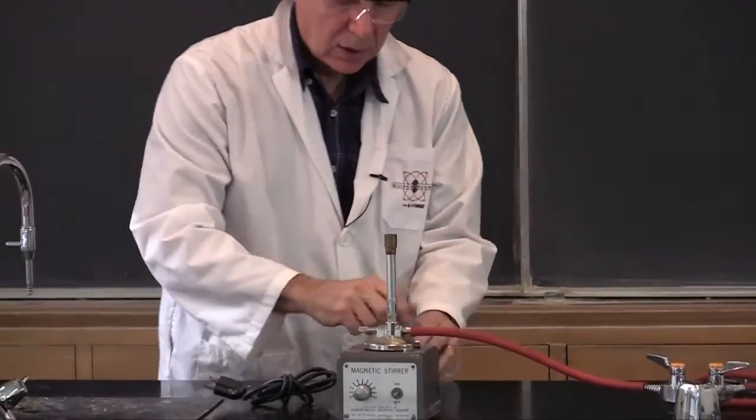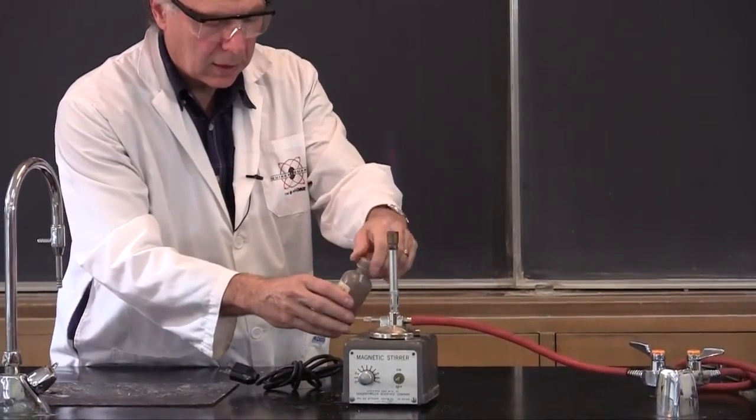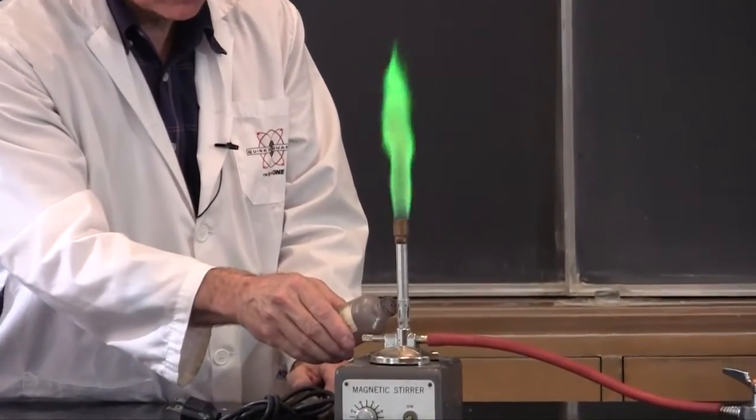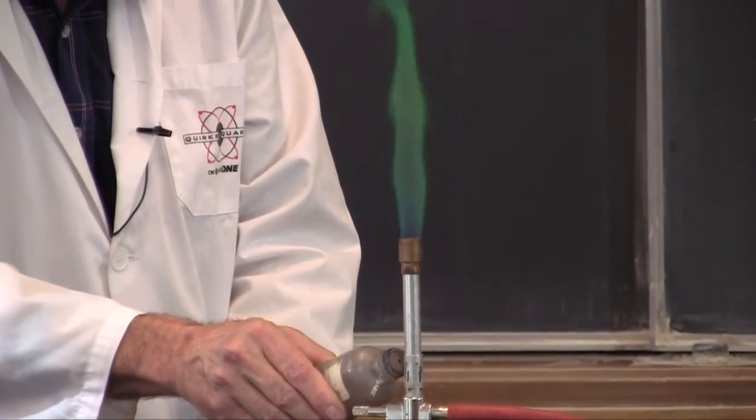All right, so shake it up a bit. You put it up close to the opening and just give it a squeeze. Every time you squeeze it, some of the particles go in there. We get the same effect.